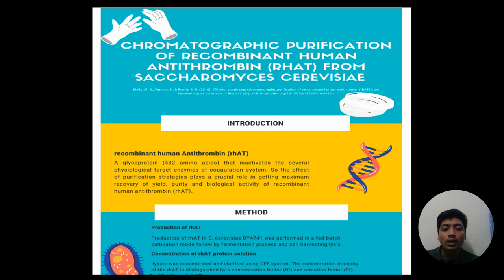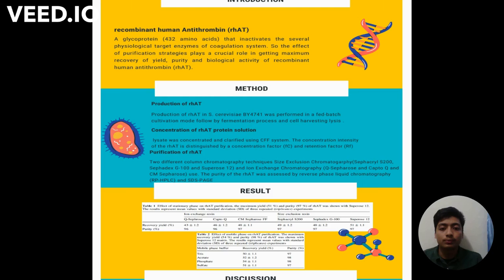In addition, the effects of various physicochemical parameters such as mobile phase, flow rate, sample volume, and volume concentration on rhAT purification were also investigated. Okay, now let's see the method performed in this journal for the purification of the protein.